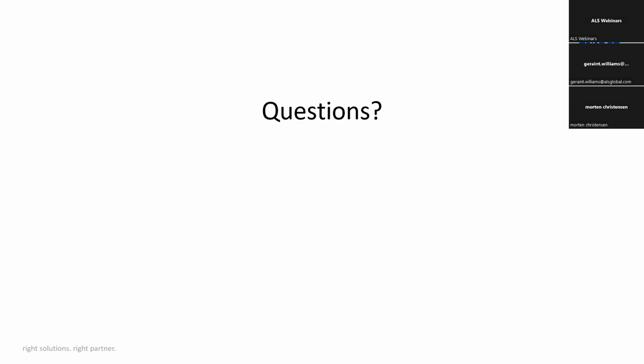later today or tomorrow. The last one is a fairly technical question I got here, Geraint. It's on iron concentrations in TOP assay. Okay. What can we say about that?